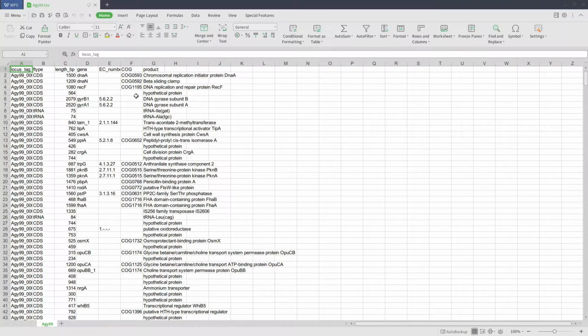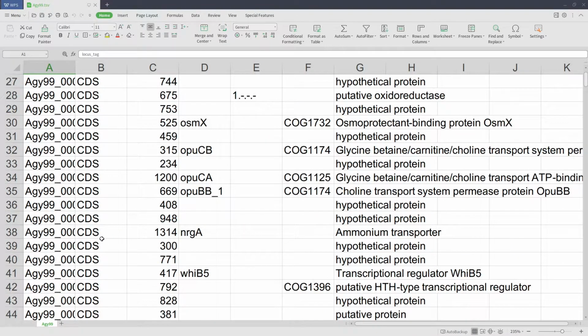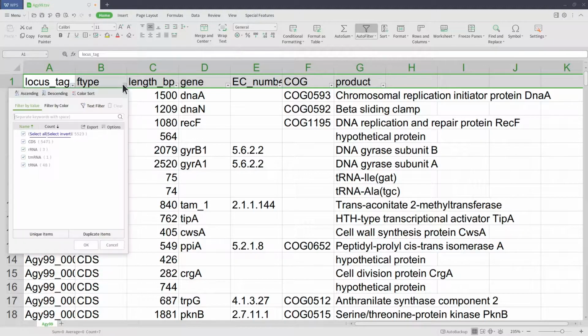I'm using this tool here, and this is what comes up. Let's zoom in here so you can see it better. Using this one, you can also read and try to get some information. Of course, here it gives you the feature types and their respective information. So let's do a sort here, or let's filter, and when we use the filter, we can filter based on feature type. At least this one will let you know which features were predicted at a glance.